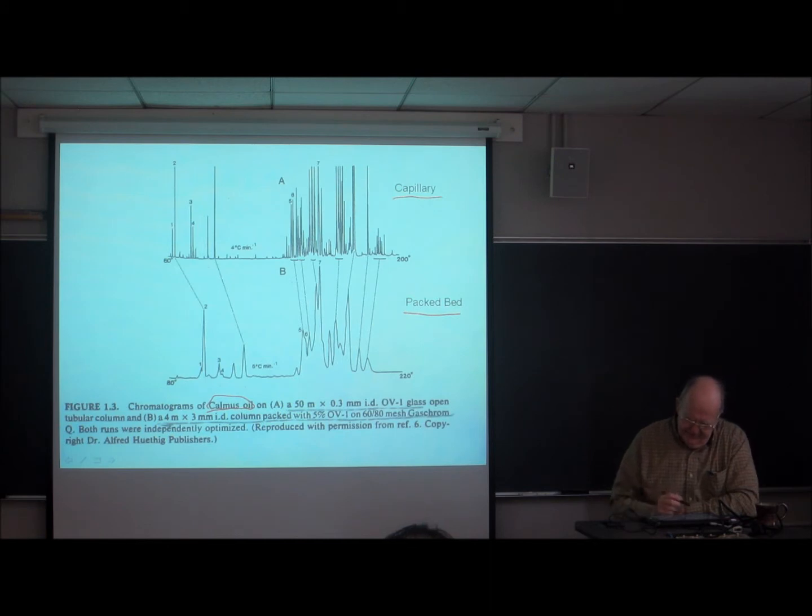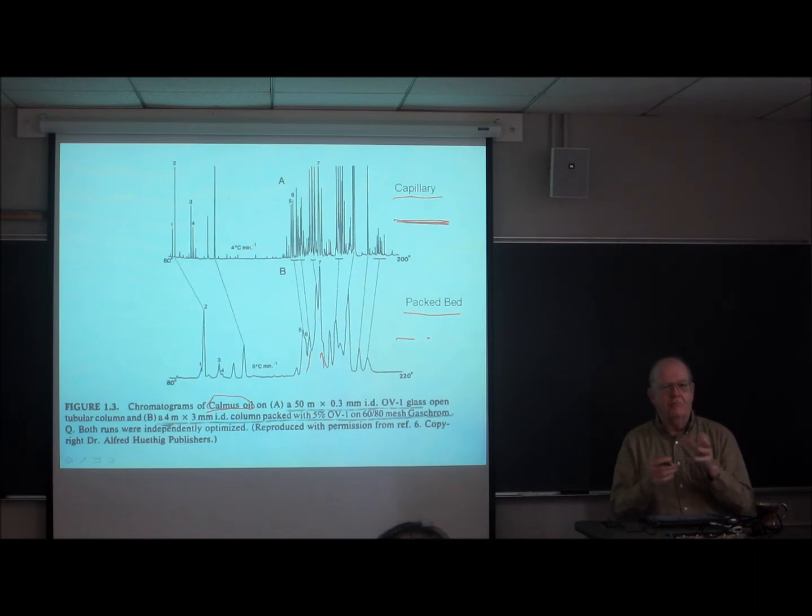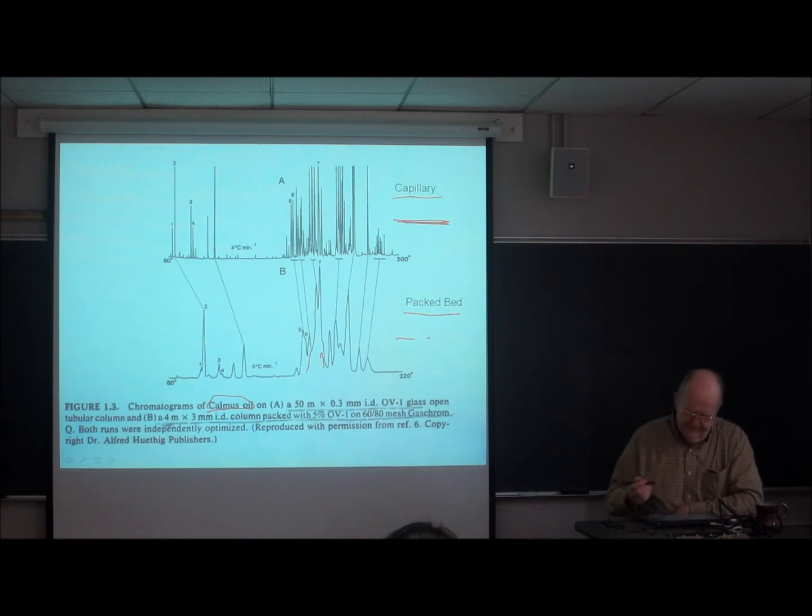But even though the stationary phase is the same and the sample is the same, you can see way, way, way more peaks up here than you can see here. I mean, this thing here is probably a collection of maybe 10 or 15 peaks. So it's not 2 peaks, it's a whole bunch of compounds that happen to just not separate well enough, peaks narrow enough so that you can actually see the spikes. Again, a clear demonstration of the vastly improved resolution available in a capillary system versus a packed bed.